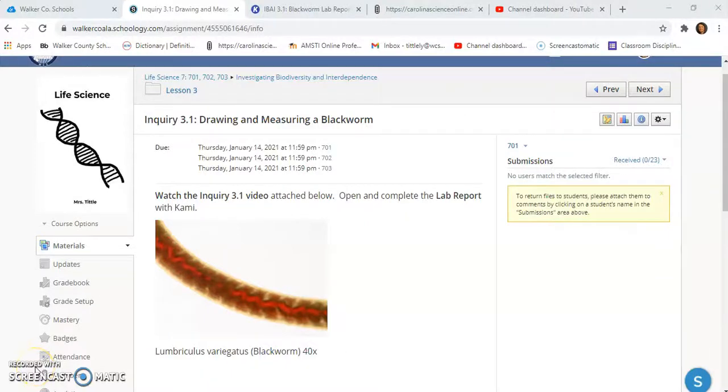Good morning, students. This is Miss Tittle, and today we are working on Inquiry 3.1. We're going to be drawing and measuring a blackworm. So for this assignment, you're supposed to watch this video and then complete your lab report. So let's take a look at your lab report.